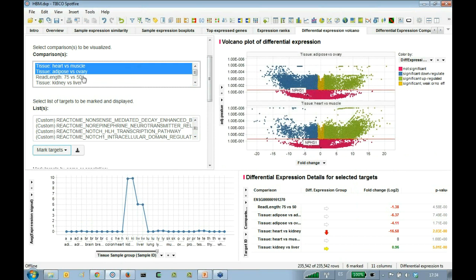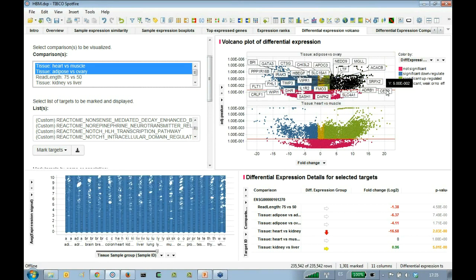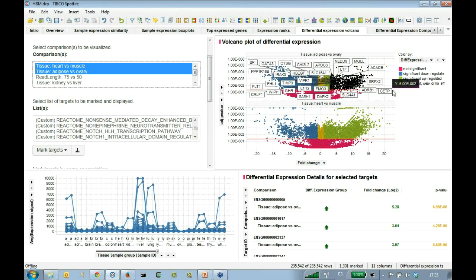And for example, another of the questions that we addressed initially, is there significant differences between the different tissues, can be easily answered here, where you can, in a very easy manner, see those cases that are significantly different, those that are above the red line, and with a higher fold change, which are those that are farther away from the zero, either upregulated or downregulated in the respective tissue.